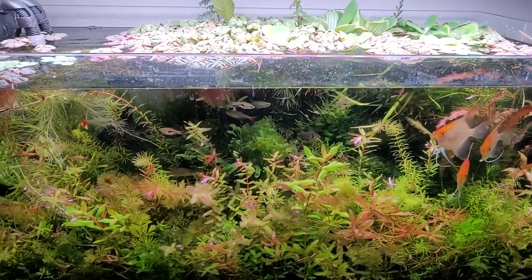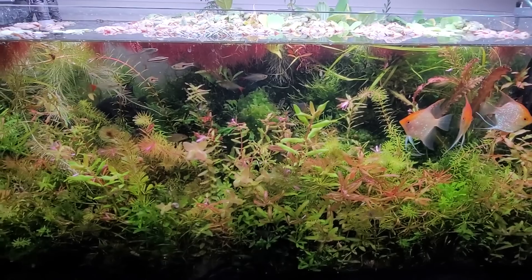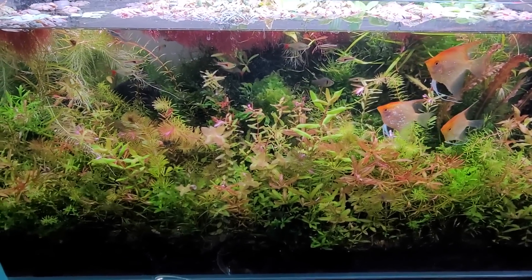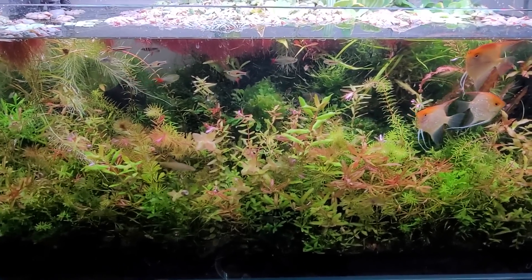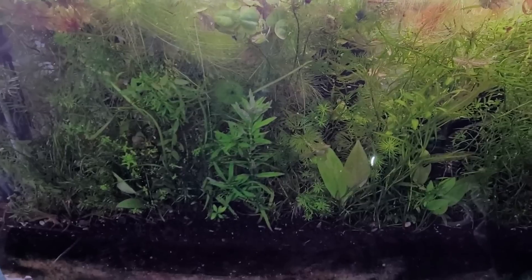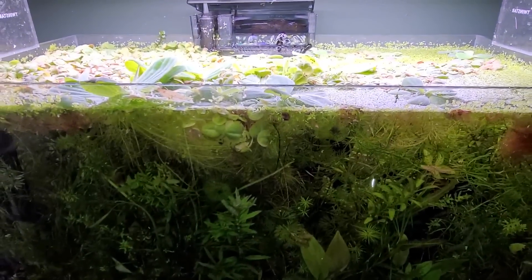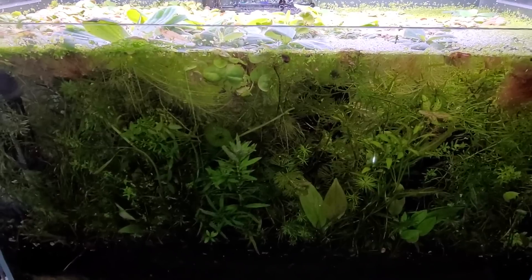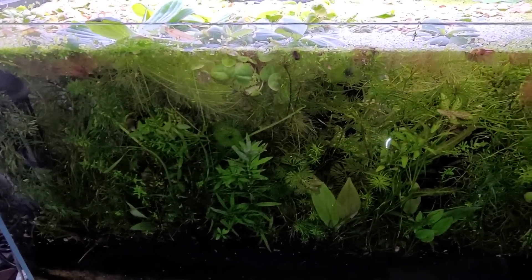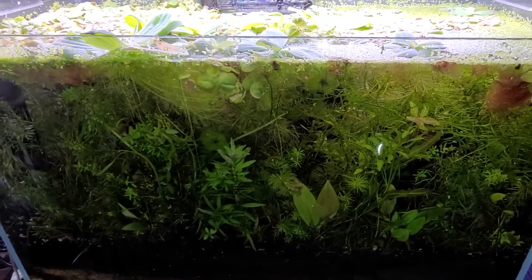Over the years, I've looked at the aquarium through the microscope hundreds and hundreds of times — all sorts of different things. What's always interested me are the little creatures that you find everywhere. Today, we're going to be looking at the impact of age and seasoning in an aquarium on filter media, and specifically acrylic filter floss. We're looking at my tanks; this one has been set up for three years or more. We'll be looking at a number of tanks, including some that are extremely overgrown with life and others that have a sandy bottom with no active substrate.